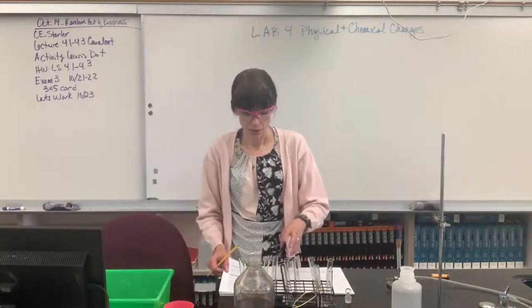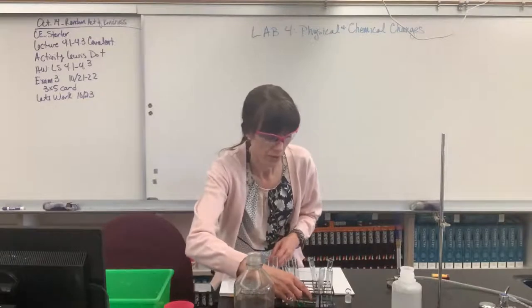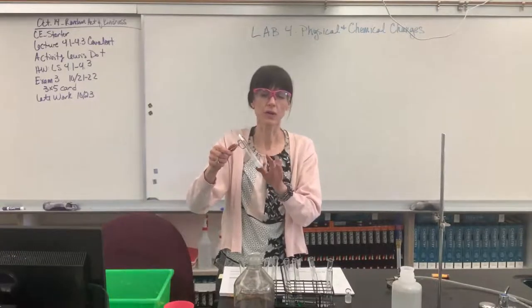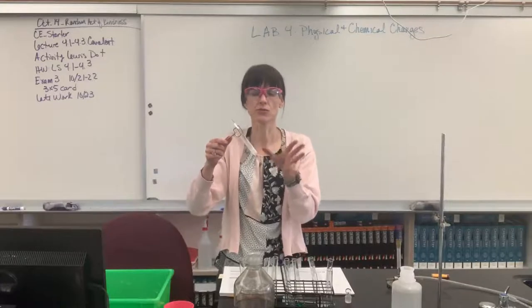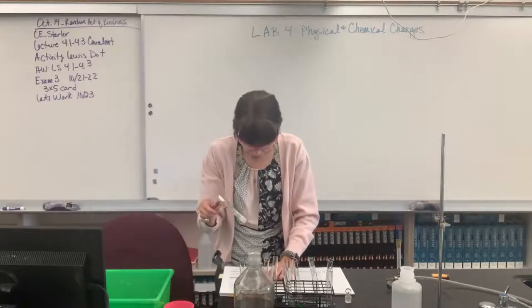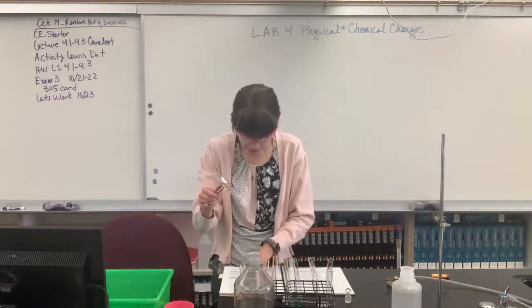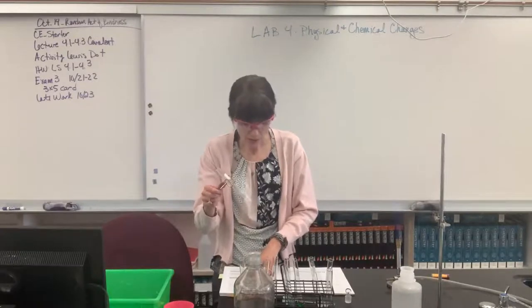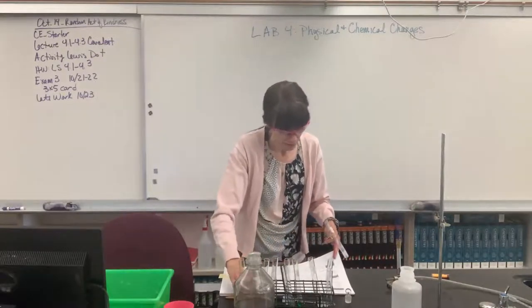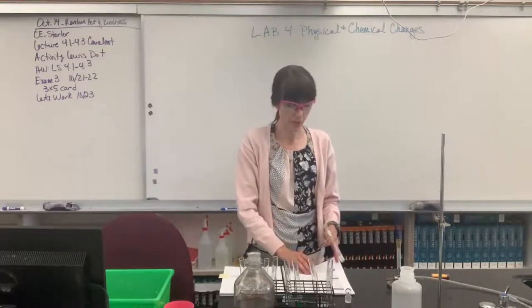So now we can go back to our sodium bicarbonate. Remember it was the white powder, and let me pull this up for you. I had heated that, we added the HCl to it, heated it, it's cooled now, and it has this white powder around it. We wanted to drive off all of the liquid to bring it back to the solid, to reconstitute the solid. So we did step 5, evaporate the solution, and then it says recover the solid. Okay, we did that. Record the color, it's white. So let's go to table 4.7, and the recovered sample is white. I'm on part D, table 4.7, color of sample under recovered solid. It's white.